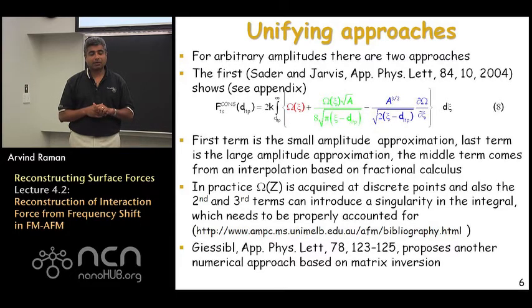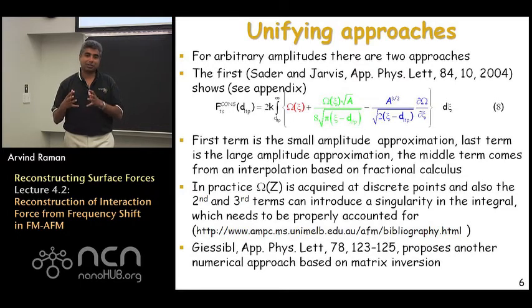So from the early days in FM-AFM, there was this need to come up with a way to invert this frequency shift regardless of the oscillation amplitude, or without assuming small or large oscillation amplitude. There are two approaches today for getting over this problem.